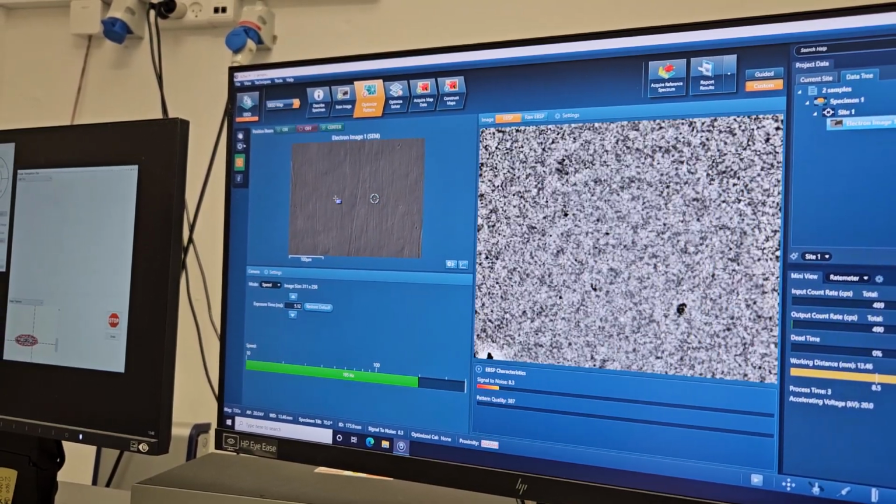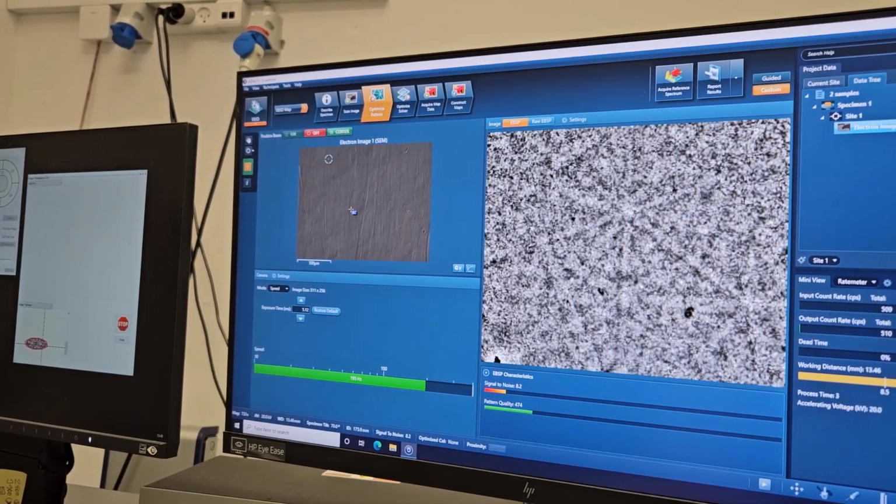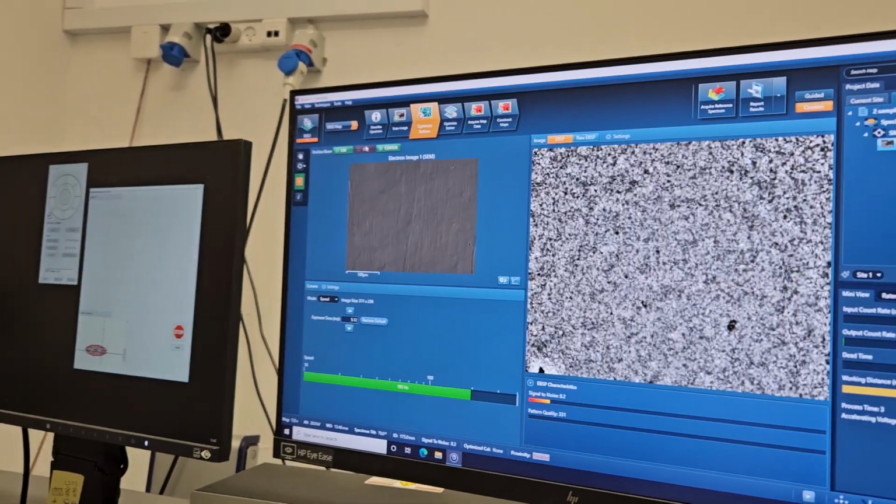Okay, now actually the quality is much worse. And a few places should.